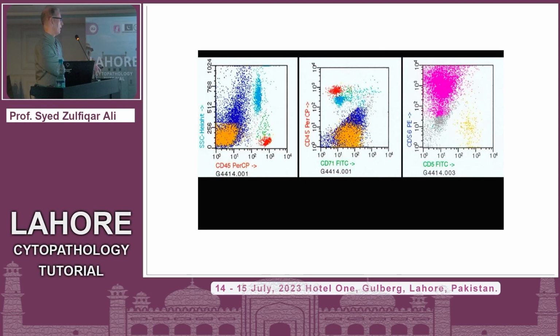Those cells, as you can see, are CD45 negative, so they are not lymphoid. And when you gate them further, they all are expressing CD71 activation markers, so it's clearly an aggressive tumor. And when you gate these further, they are all CD56 positive, which means that it's likely a neuroendocrine tumor. So indirectly, our money we spent paid off.